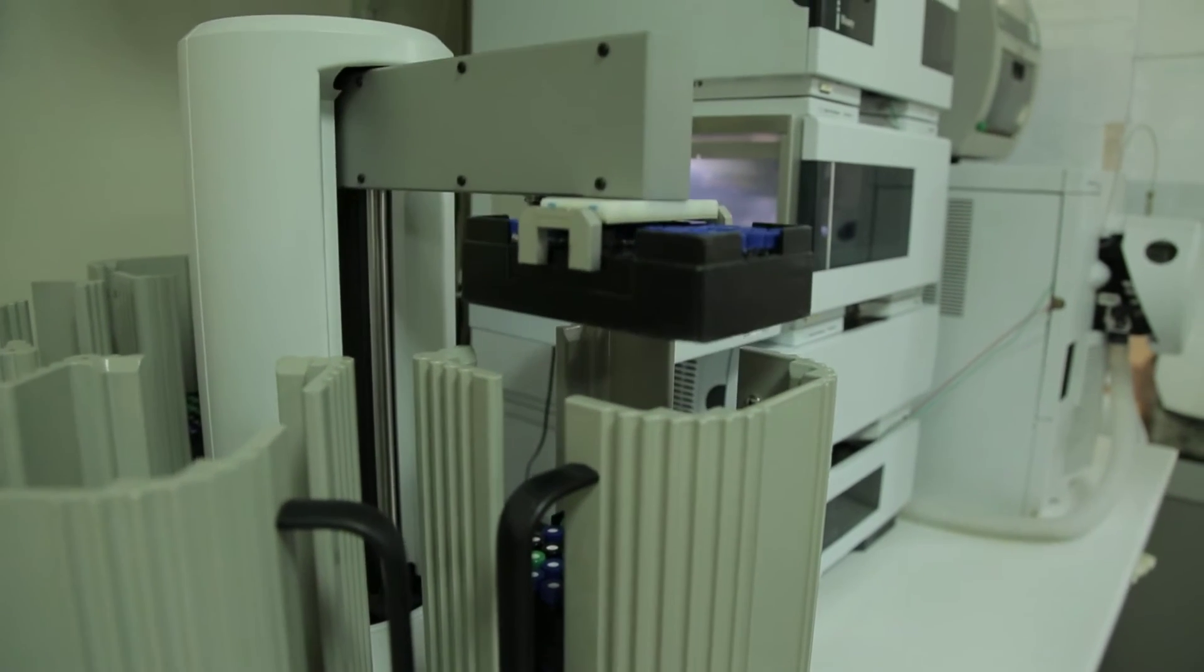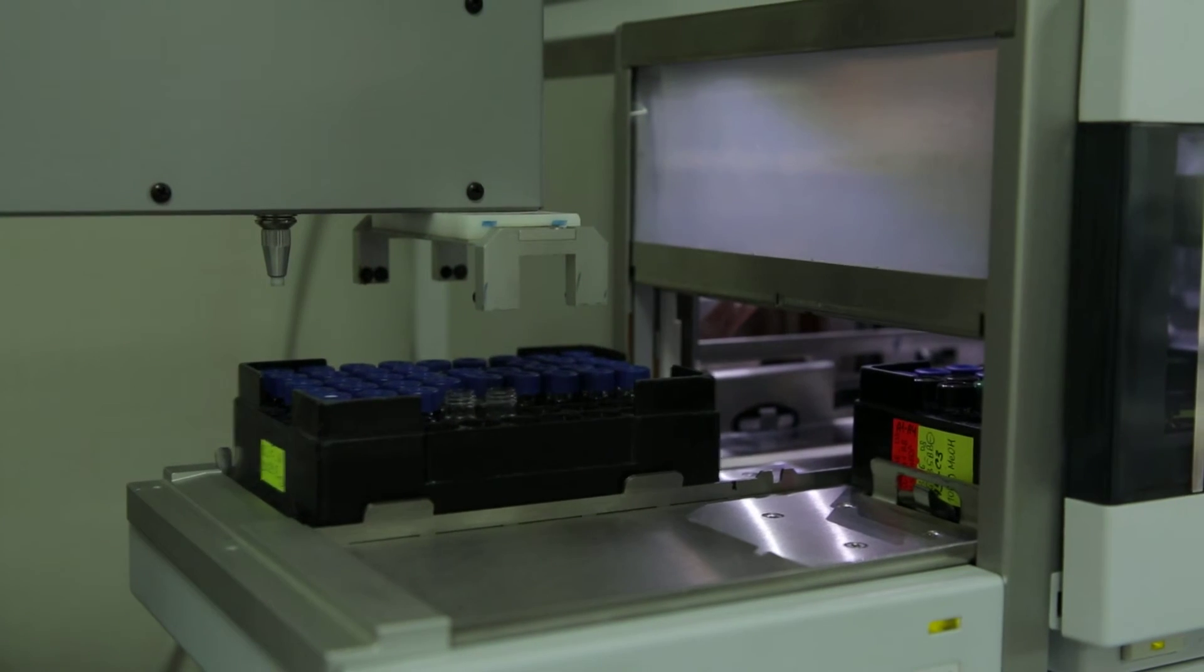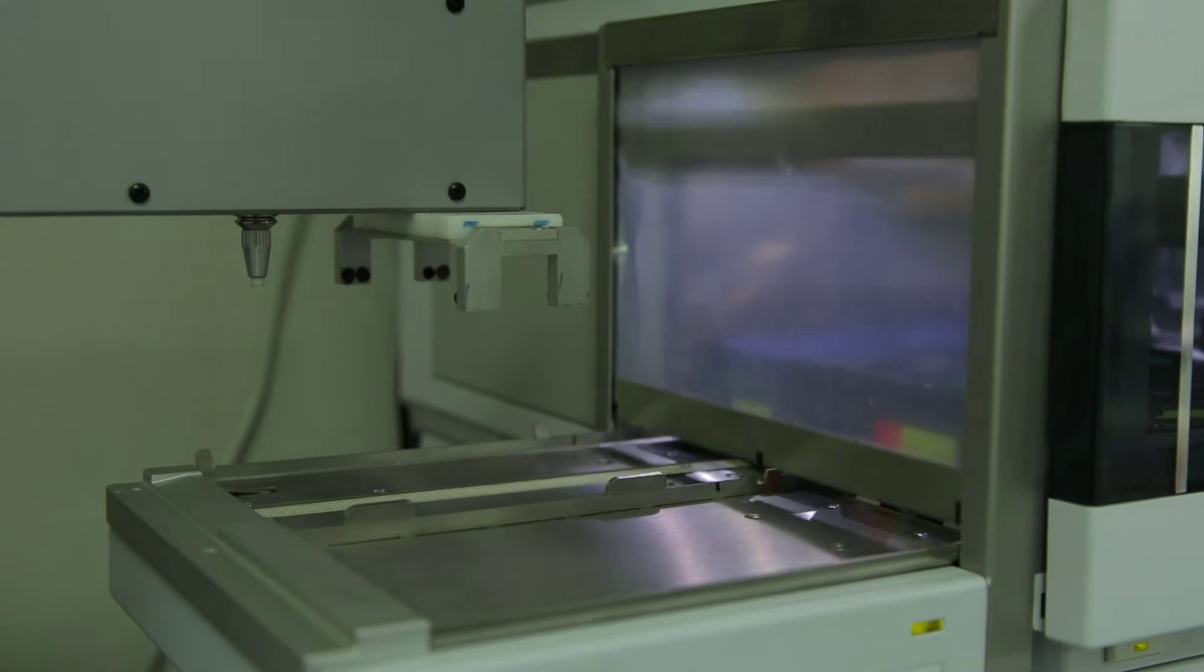Our laboratory is equipped with five Agilent LC-MS and two Agilent GC-MS instruments. For detection we use mass-selective, diode array, and evaporative light scattering detectors. The laboratory operates 24 hours a day, seven days a week. Thanks to automated sampling it is possible to conduct more than 2,000 analyses per day without permanent presence of employees.